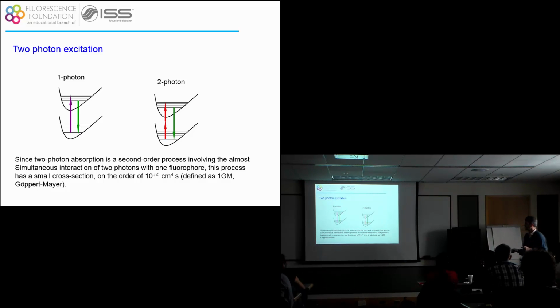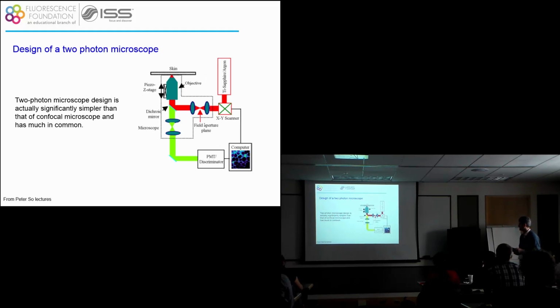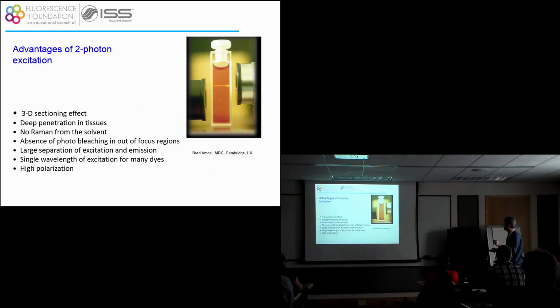What is interesting about the two-photon process is that this effect, the two-photon absorption, only occurs in a confined spatial region. So it's not a large spatial region. And this introduces, let's see if I go back here.